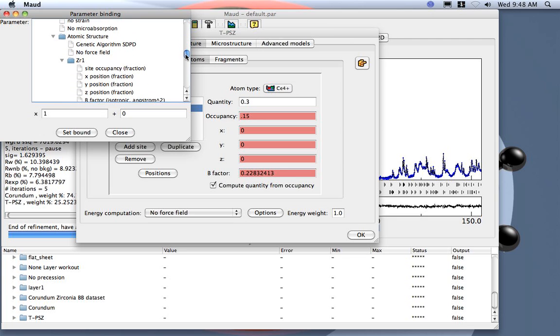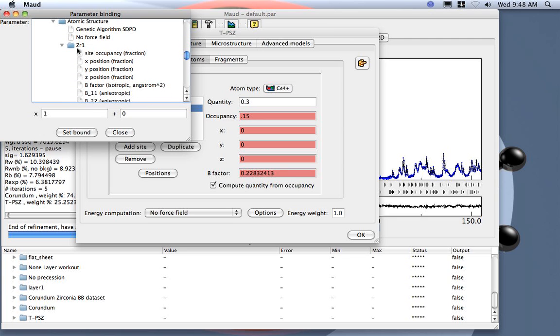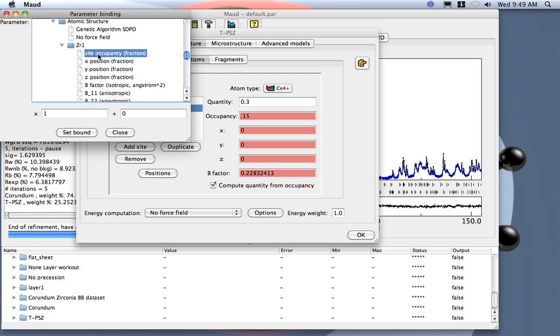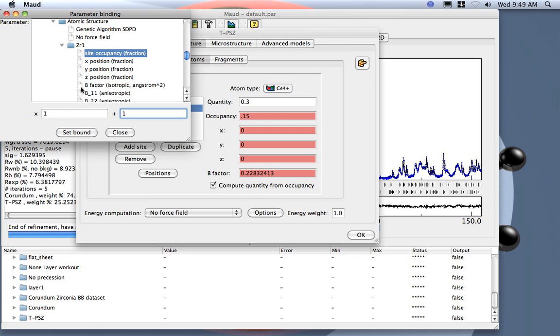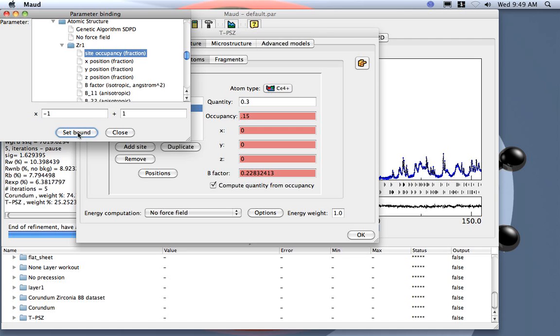Here is the zirconium atom, and we bound the occupancy of the cerium to the occupancy of the zirconium. The equation we use is just that the cerium occupancy should be equal to 1 (constant value) times the site occupancy of the zirconium minus 1. You can read it like 1 minus the occupancy of the zirconium. So I set the bound, then I close this window.